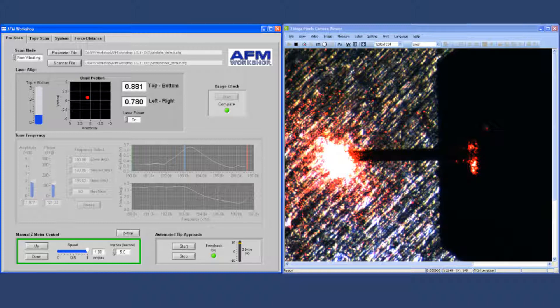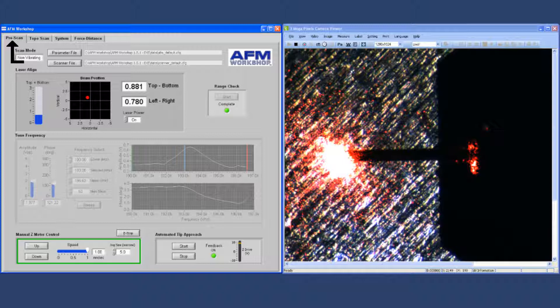The graphic user interface for the software is shown here. On the first tab is the pre-scan software, and that's used for all of the activities that are required before you do an AFM scan.